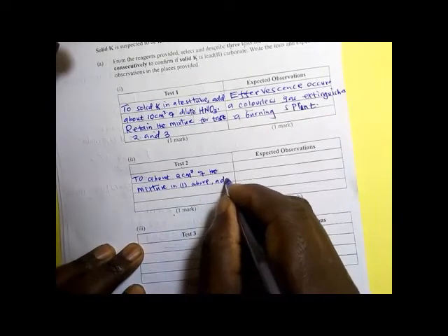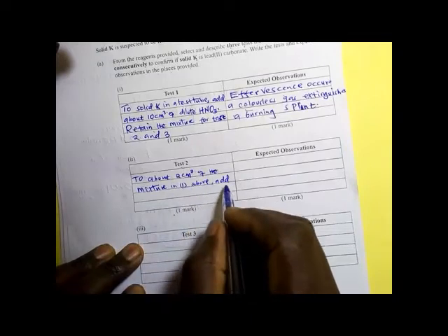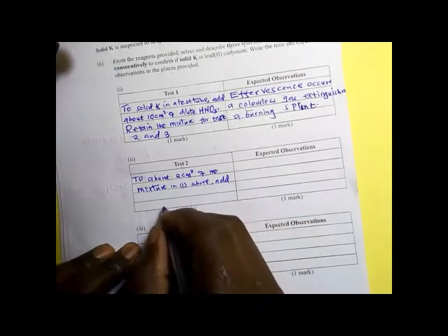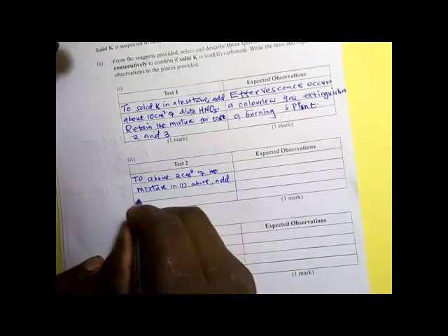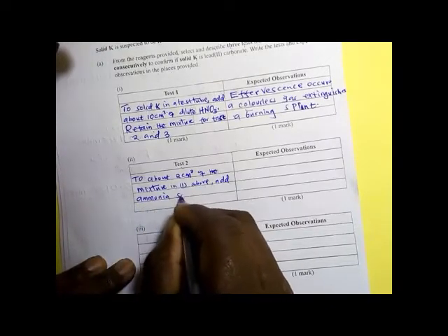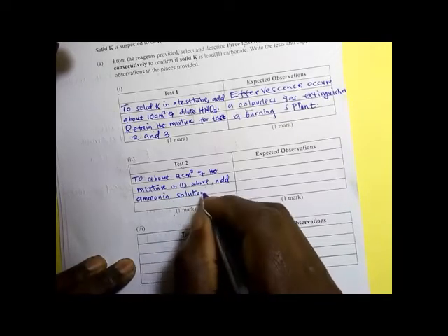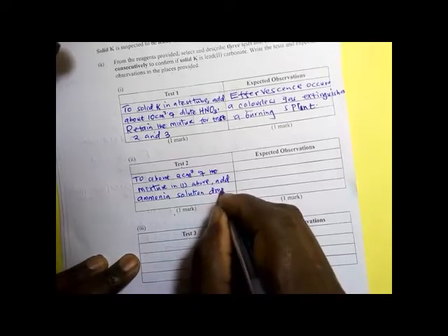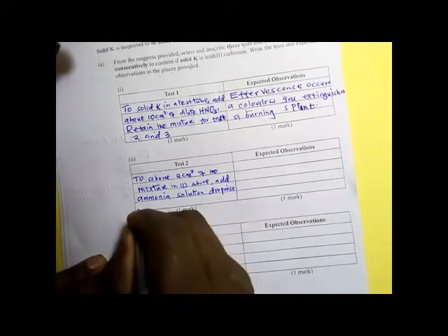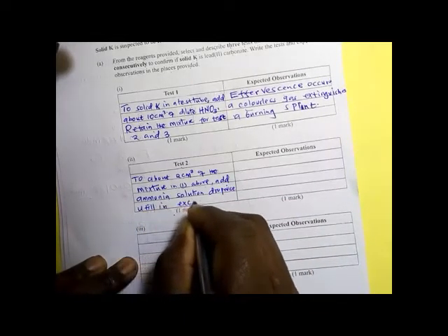Add to about 2 centimeters cube of the mixture in Roman 1 above, aqueous ammonia solution, dropwise until in excess.